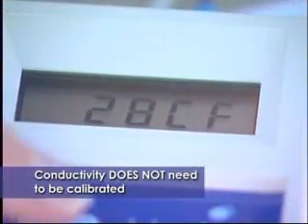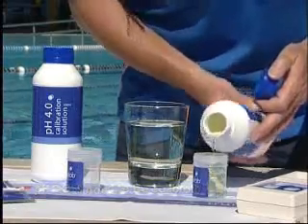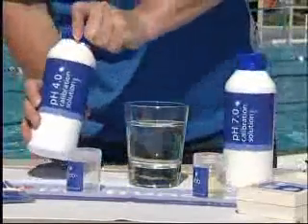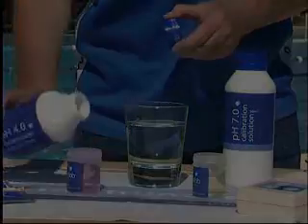The unit comes from the factory completely calibrated for conductivity but you will need to calibrate the pH. The combometer can be calibrated between pH 7 and pH 4, but if you are taking measurements that are normally above pH 7, the Bluelab combometer can be calibrated between pH 7 and pH 10.